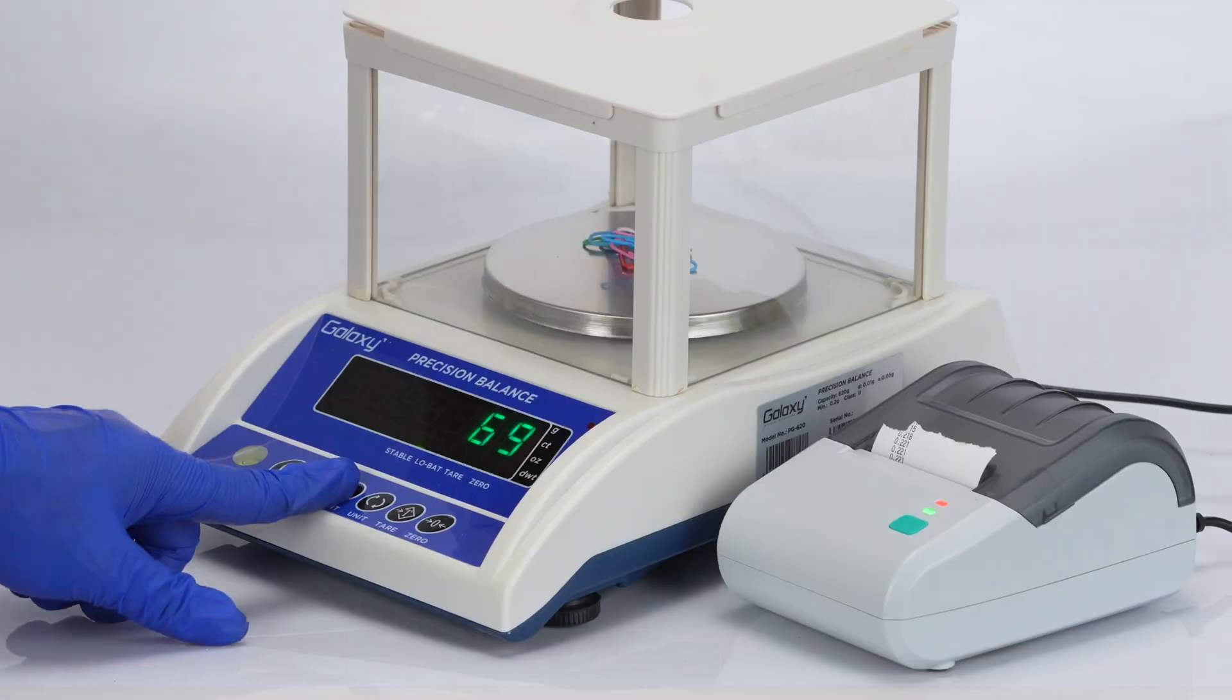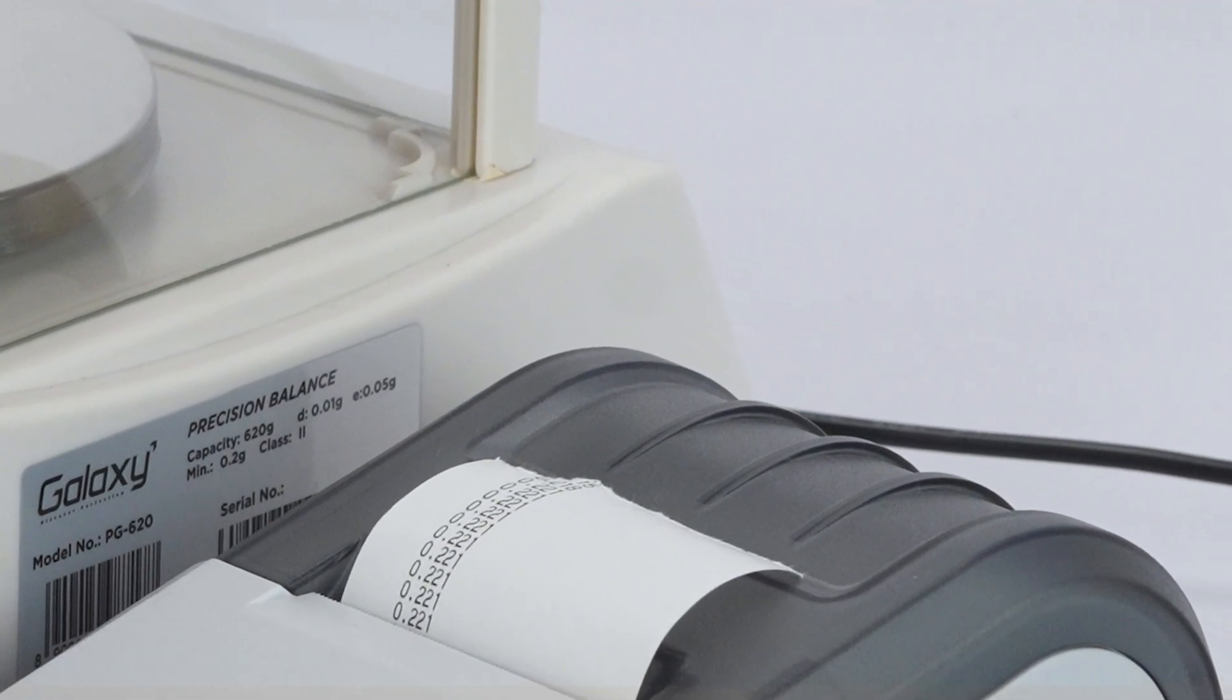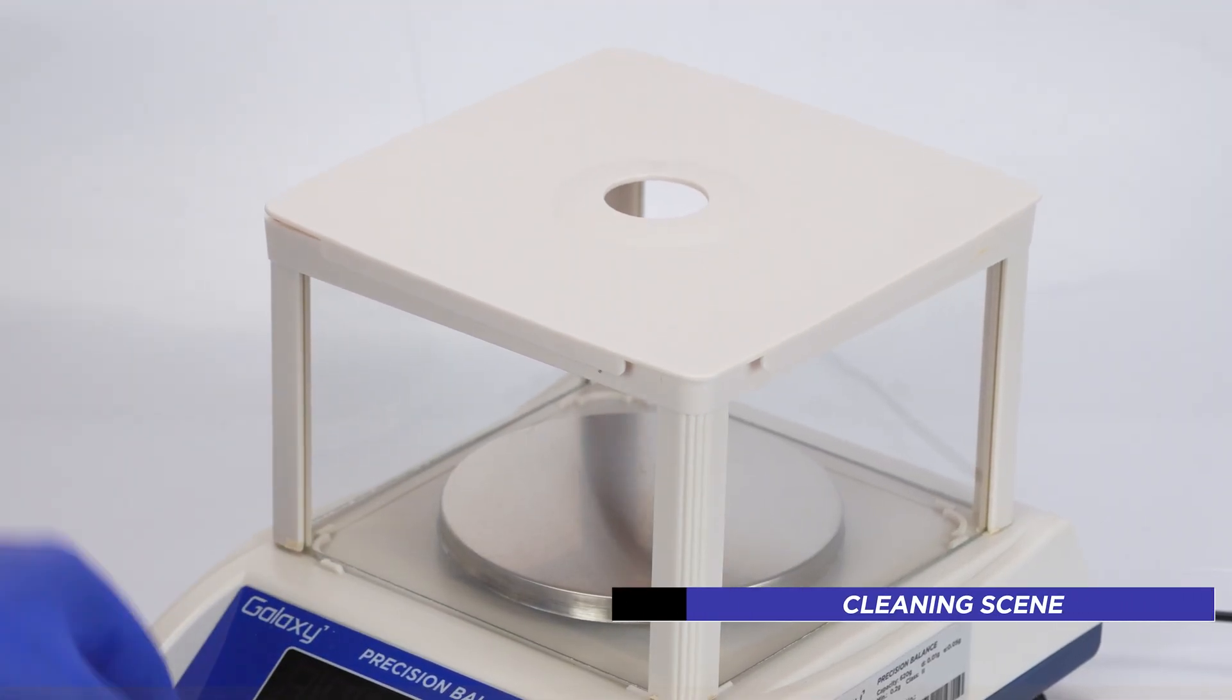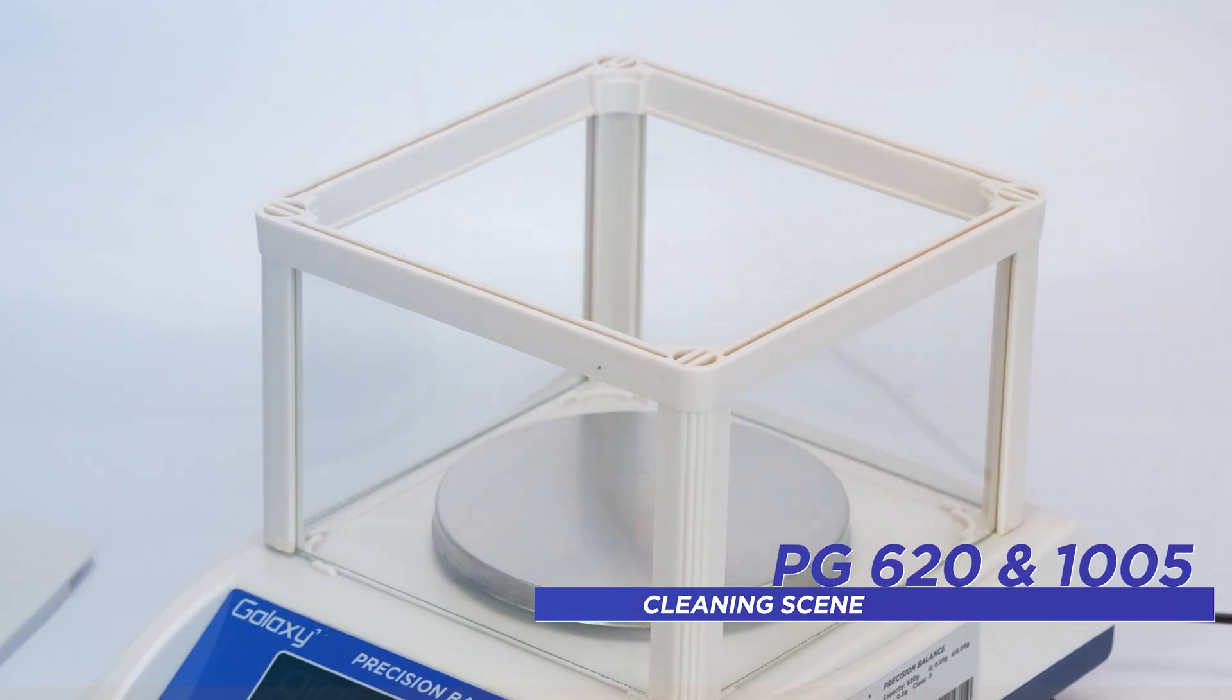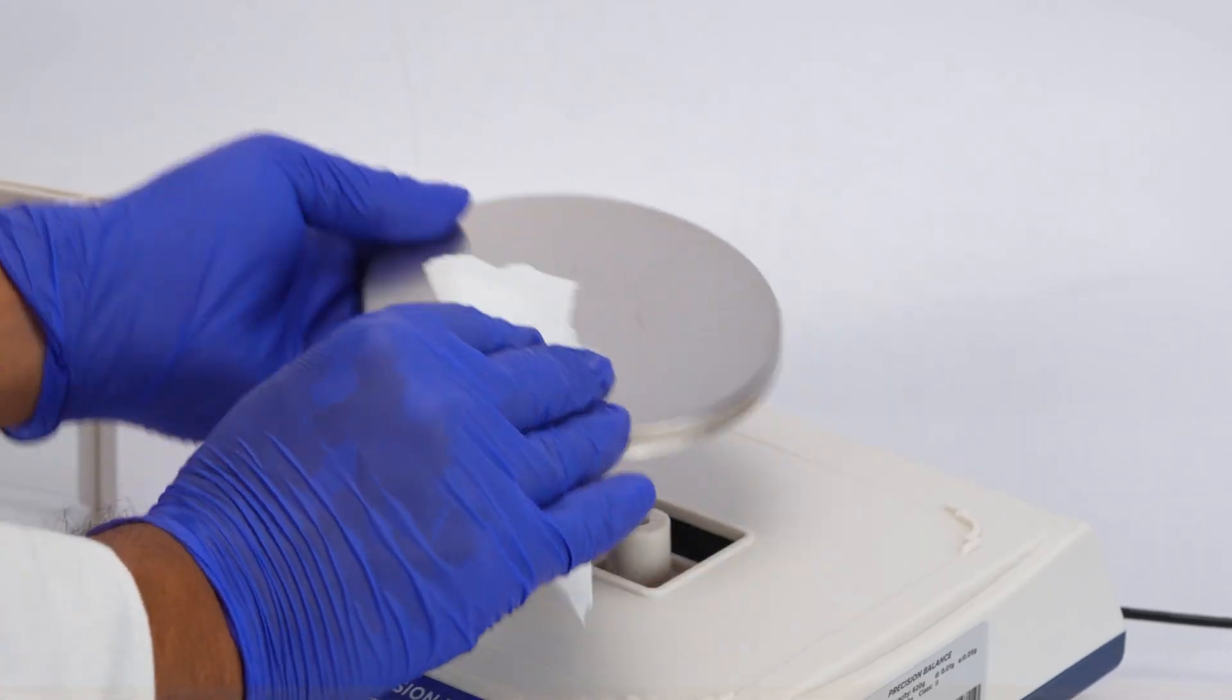To print the data, press the print key to send weighing results to connected printer. After weighing, clean the pan and surrounding area to maintain the balance's accuracy and ensure its longevity.